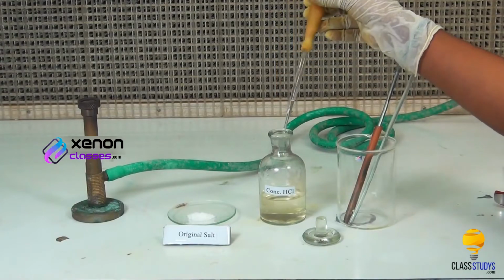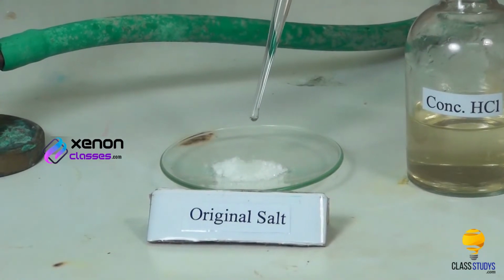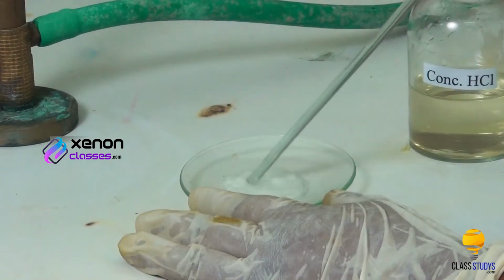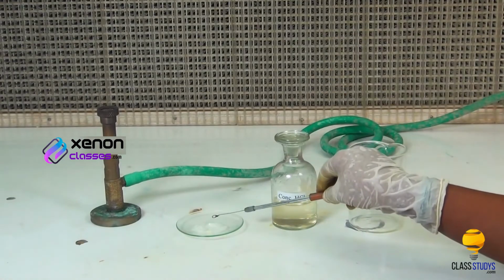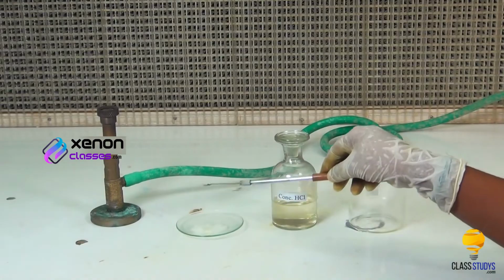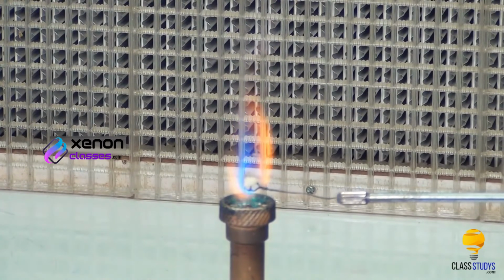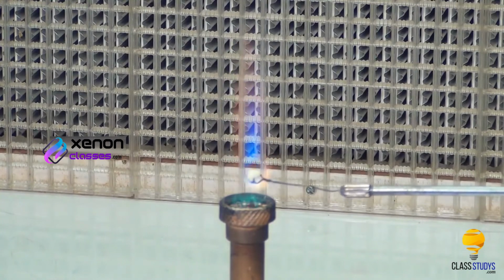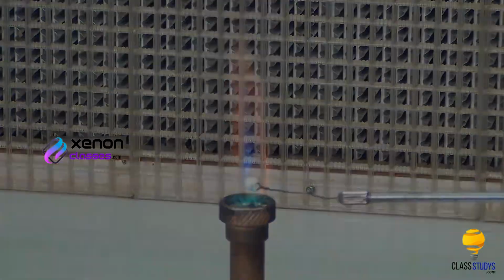To this, add a few drops of concentrated hydrochloric acid using a dropper. Mix the content of the watch glass using a glass rod to make a paste. Take a small amount of the paste on the platinum wire loop and introduce it into the oxidizing flame of the Bunsen burner. Dull bluish white flame indicates the presence of lead-2 ion.